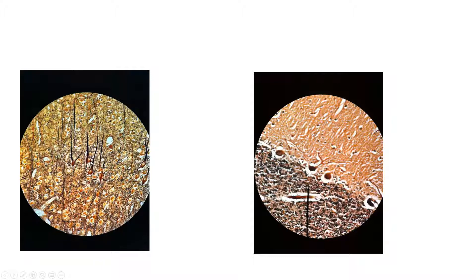They're found in the cerebral cortex. And then over here, this is the cerebellum. Right on this border between the gray and white matter, you're going to have these little cells that kind of look like they have a little tail. These are called Purkinje cells. So Purkinje cells in the cerebellum, pyramidal cells in the cerebral cortex.